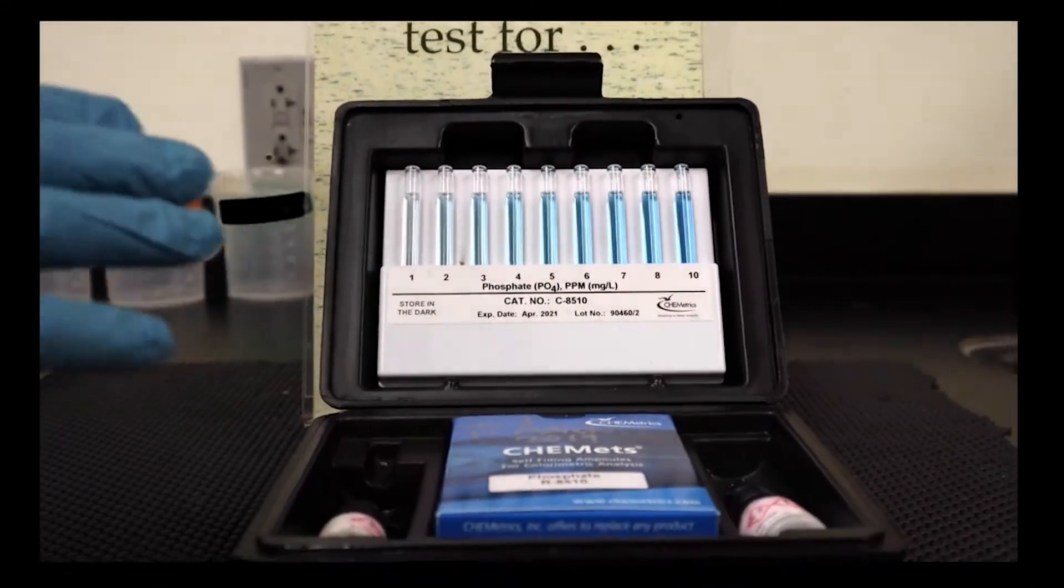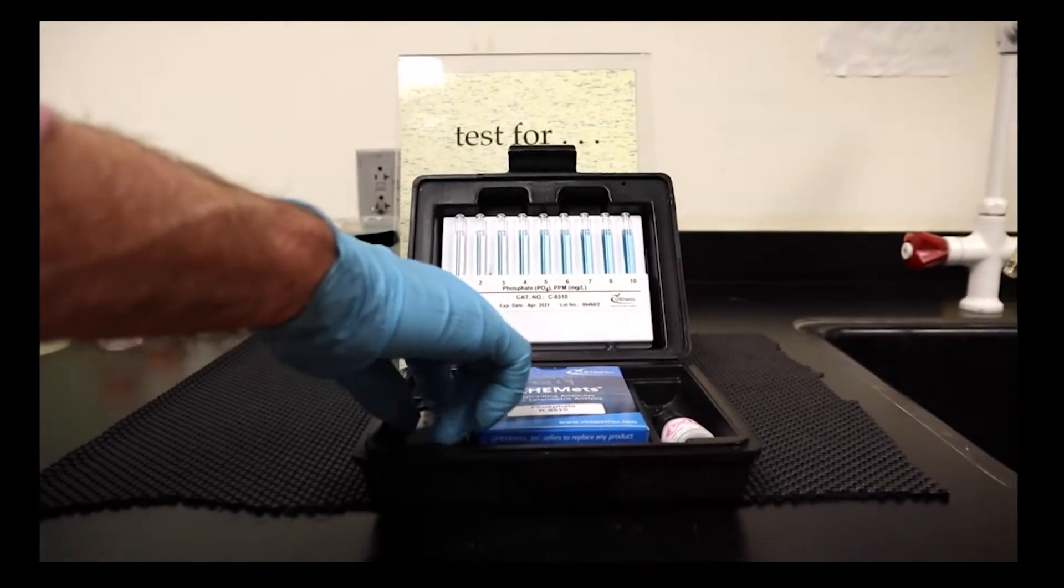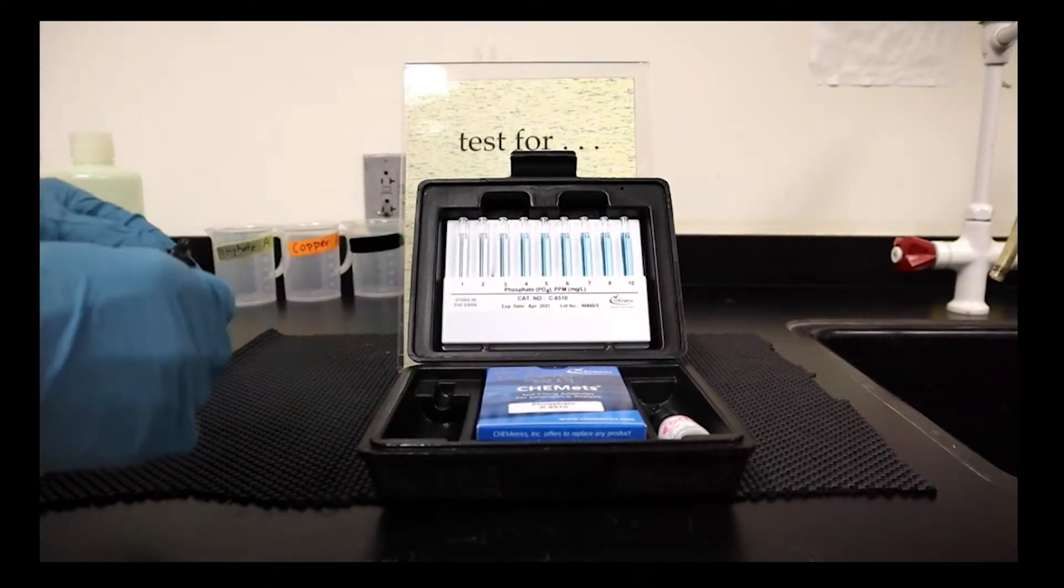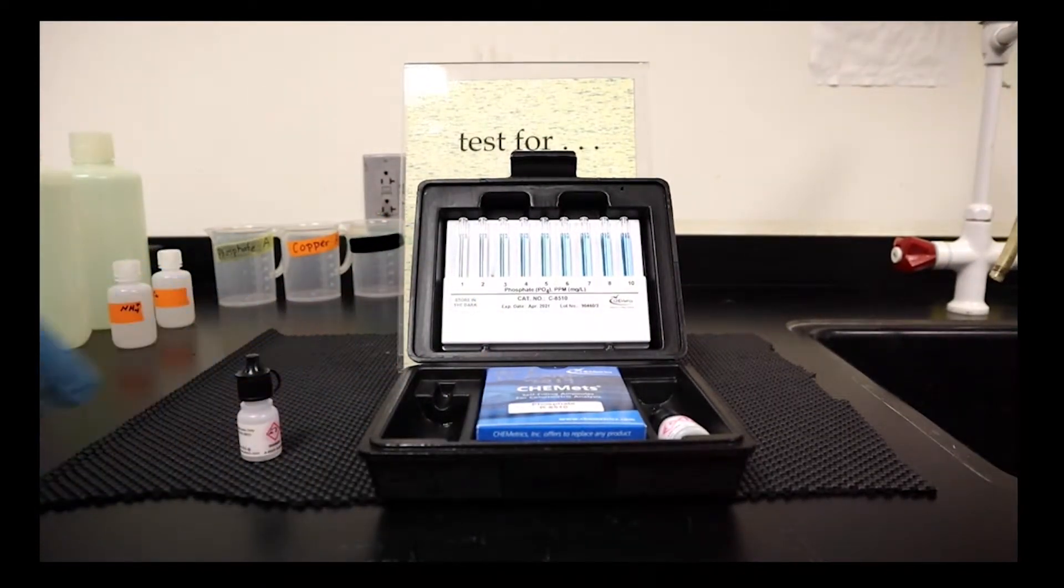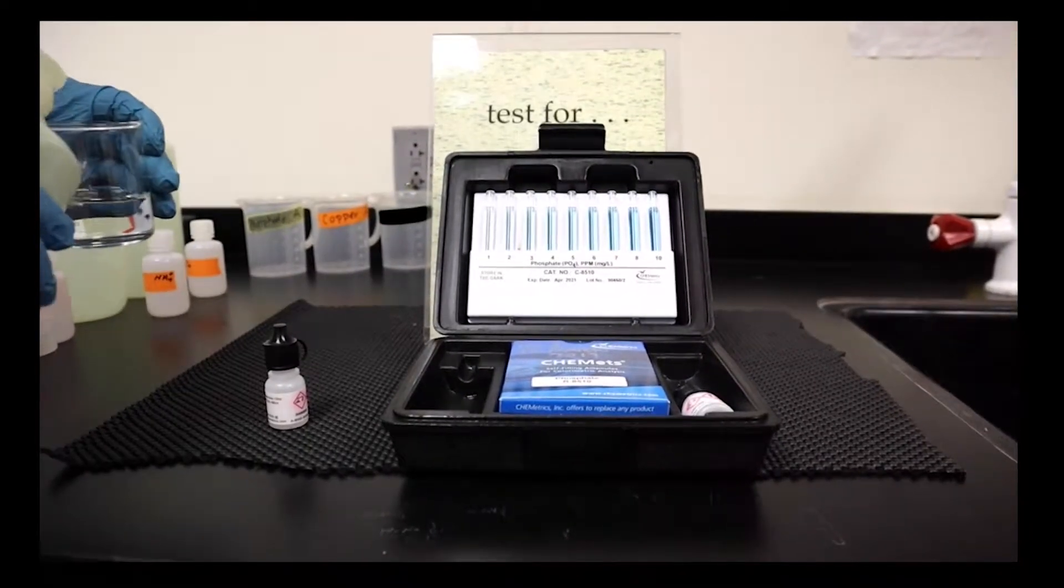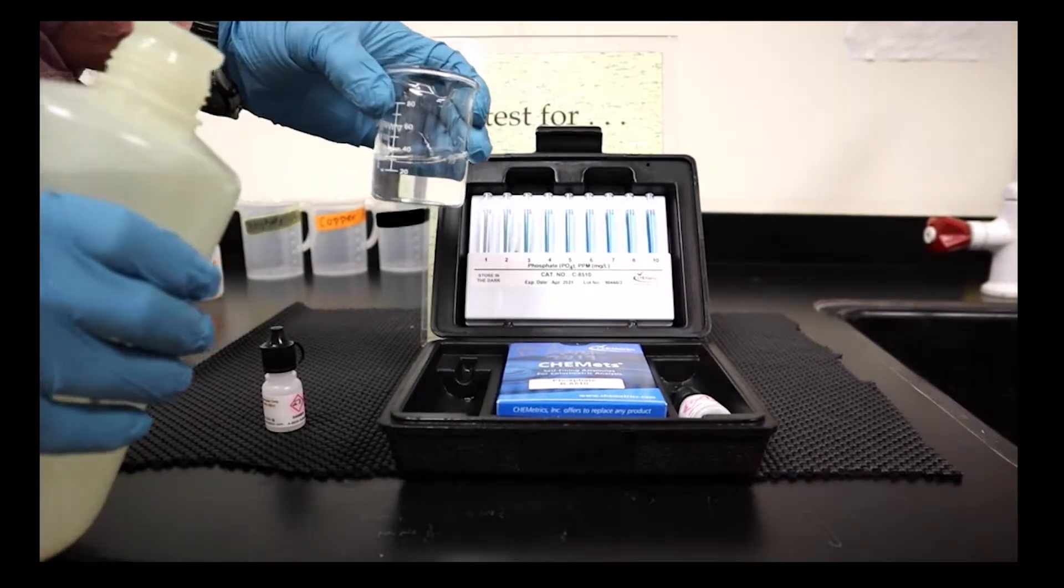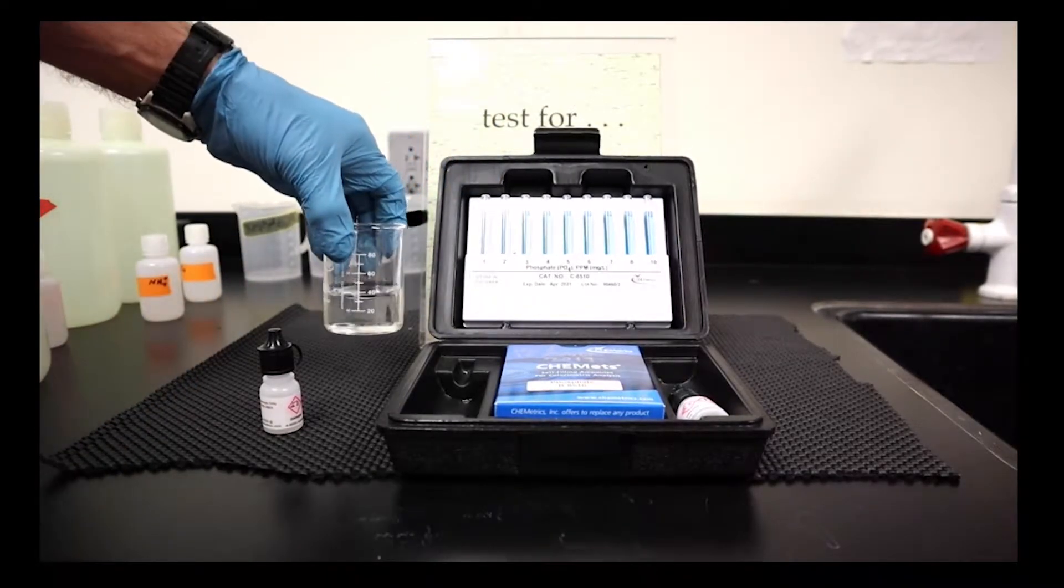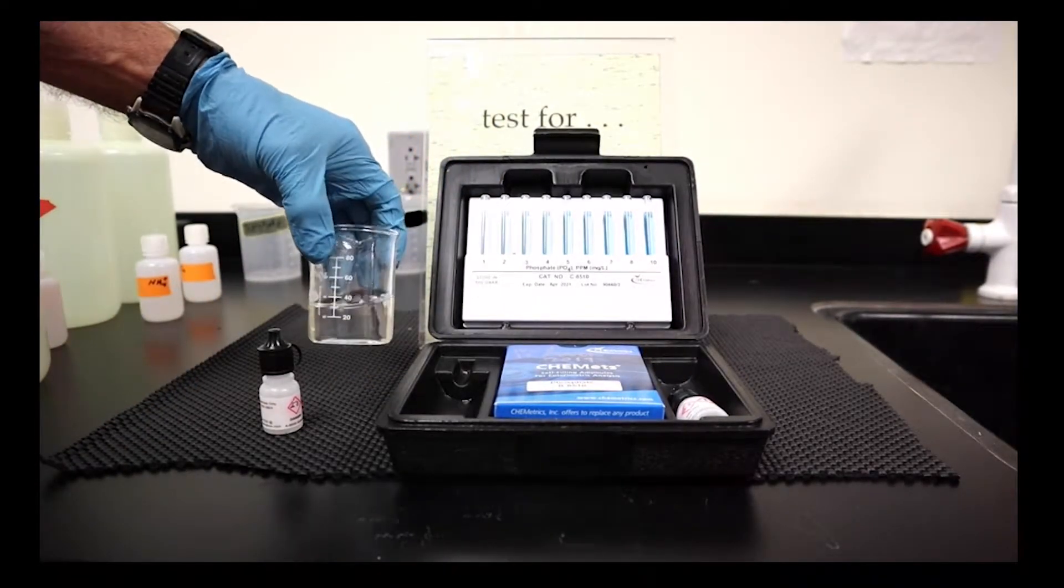So the first test will be for phosphate. What we're going to do is take a beaker and add a bit of water to this beaker, so we've just poured out of the sample bottle into the beaker.